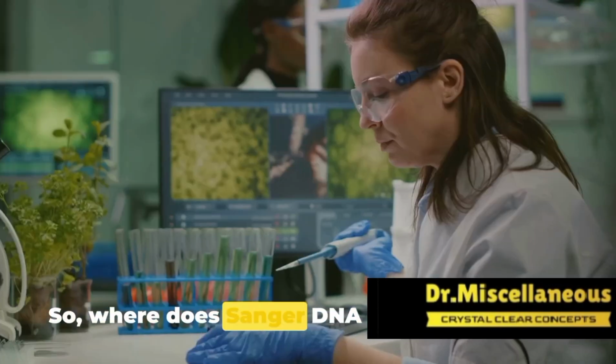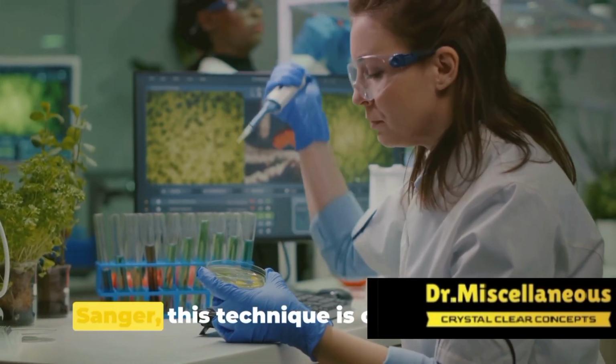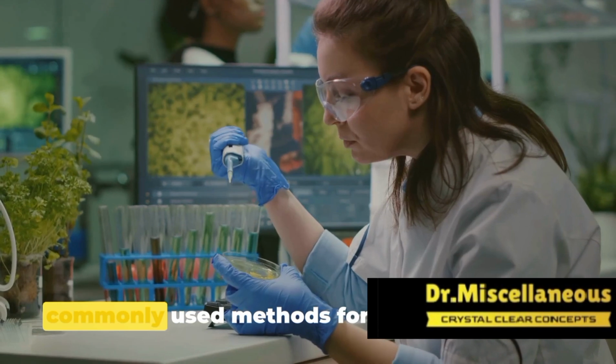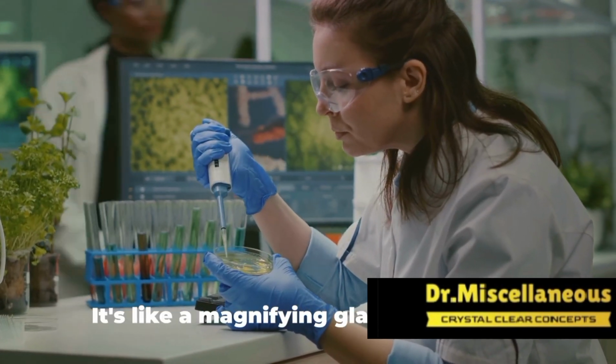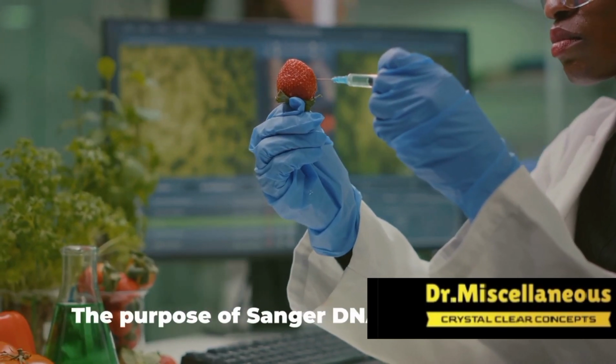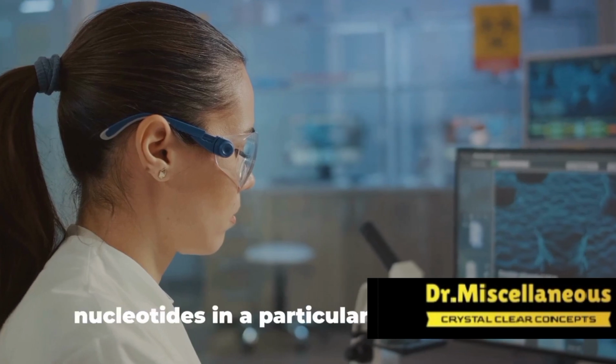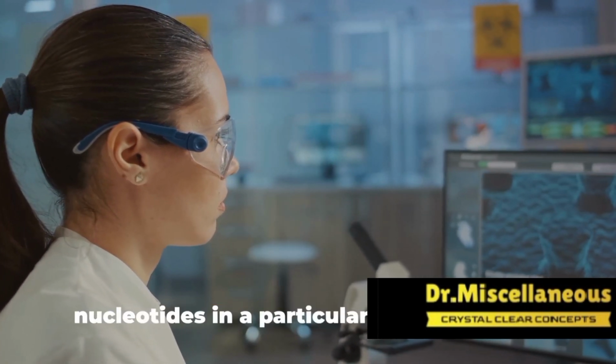So where does Sanger DNA sequencing come in? Named after its developer, Frederick Sanger, this technique is one of the most commonly used methods for DNA sequencing. It's like a magnifying glass that allows us to read the genetic code. The purpose of Sanger DNA sequencing is to determine the exact order of nucleotides in a particular DNA molecule.